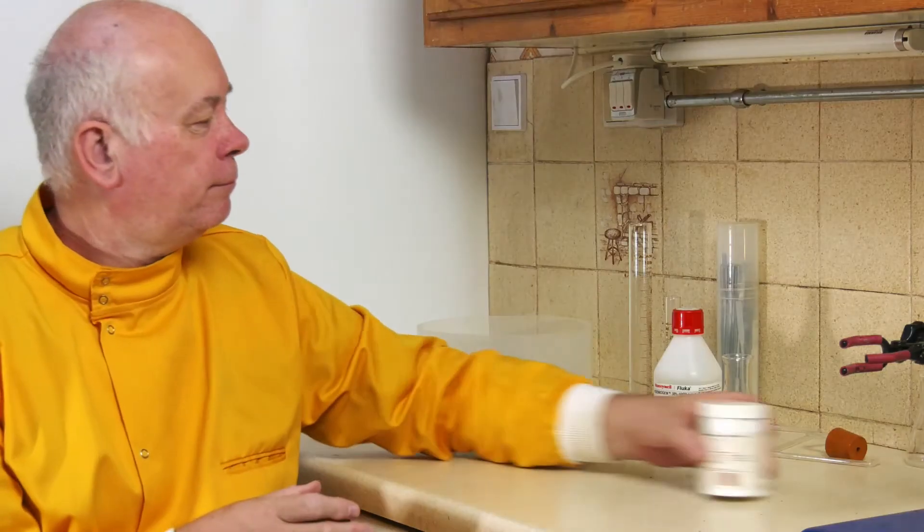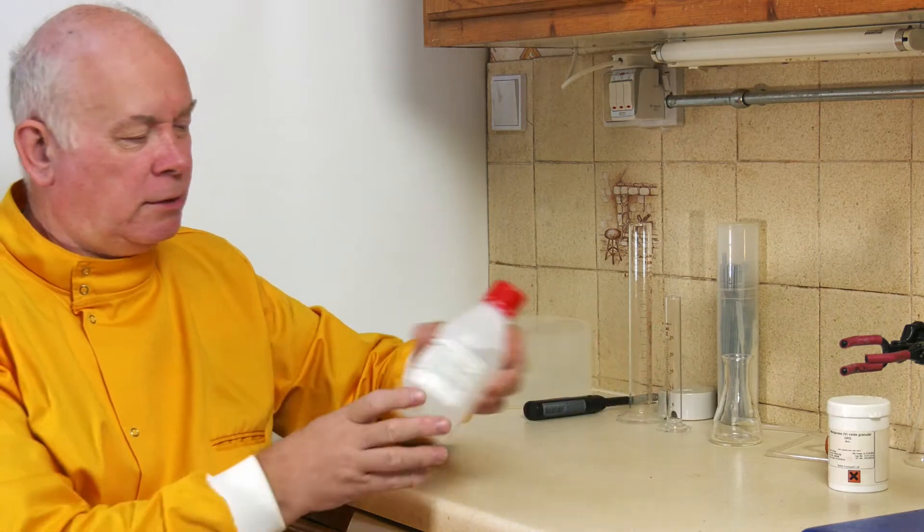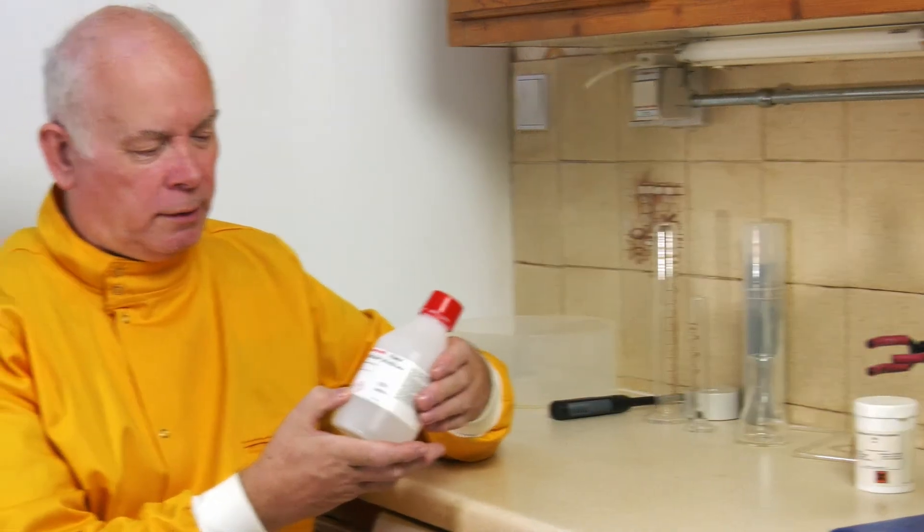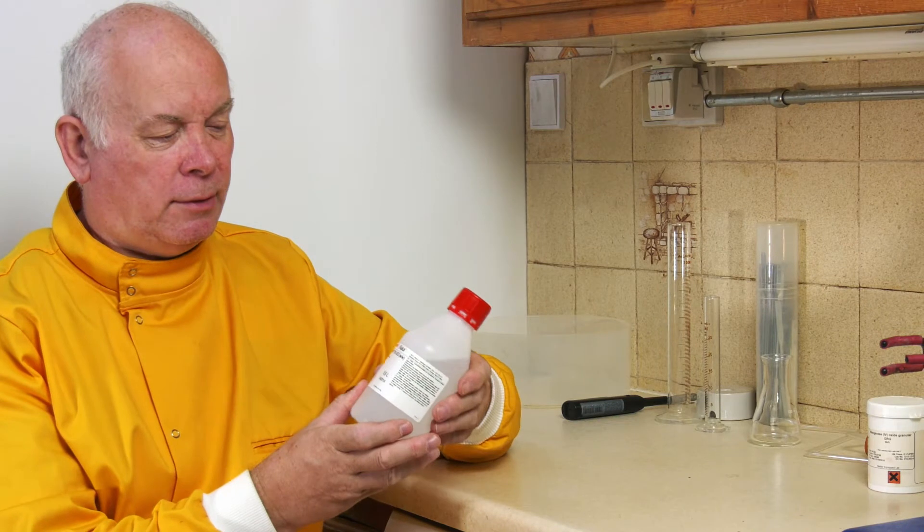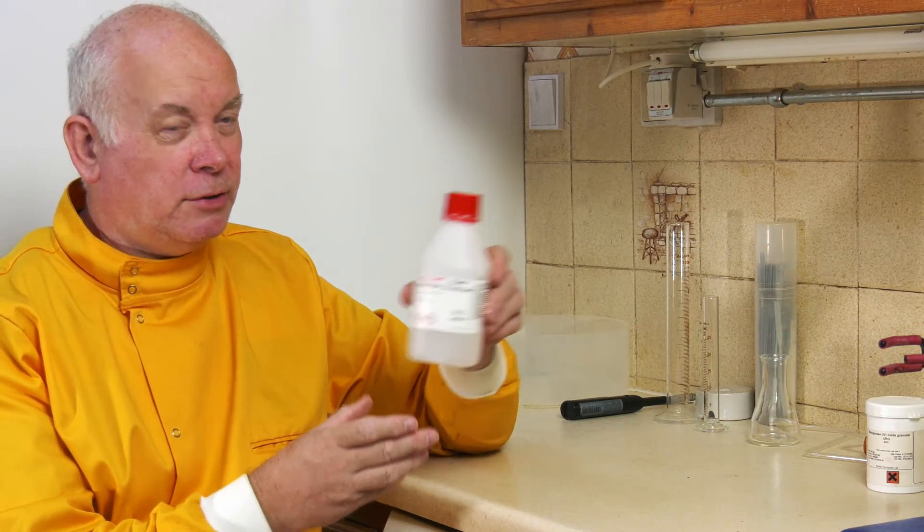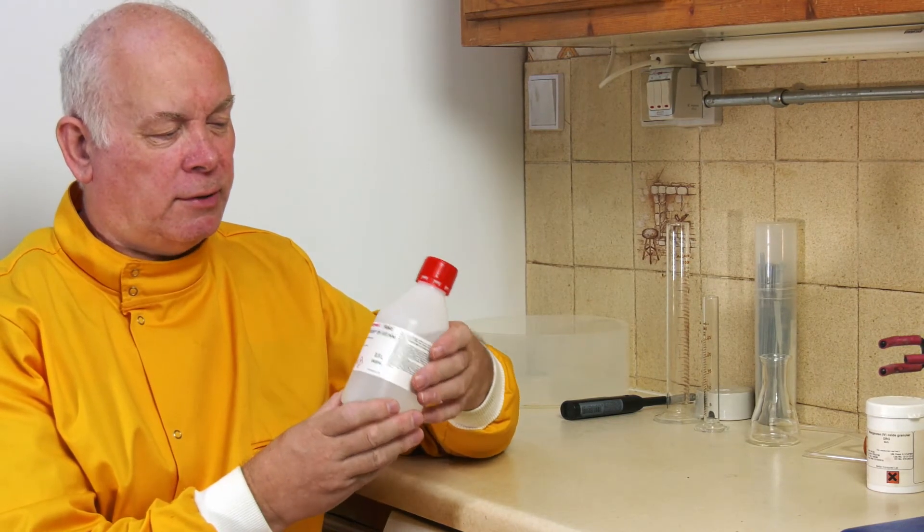It's a catalyst, we can reuse it. So at the end of this experiment what we can do is we can reclaim this and we can use it again and again. The hydrogen peroxide comes with some warnings of it being fairly corrosive - this is reasonably strong hydrogen peroxide, 30 percent.